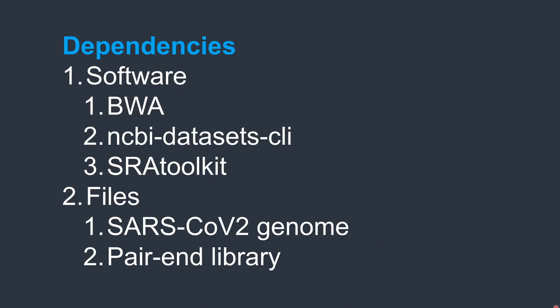Today we will show an example of how we can align paired-end reads to the coronavirus genome. The coronavirus genome is relatively small, so we can perform the alignment using a personal computer. We need to install some dependent software: BWA, the NCBI datasets command line interface to download the coronavirus genome in FASTA format, and SRA toolkit to download the paired-end sequencing library from the SRA database.